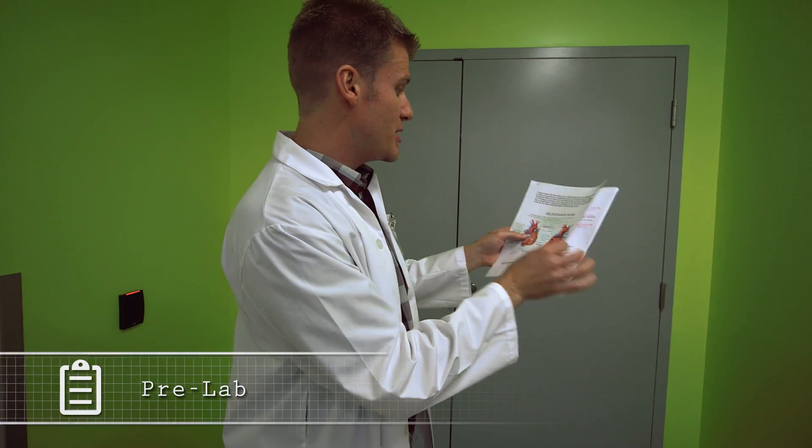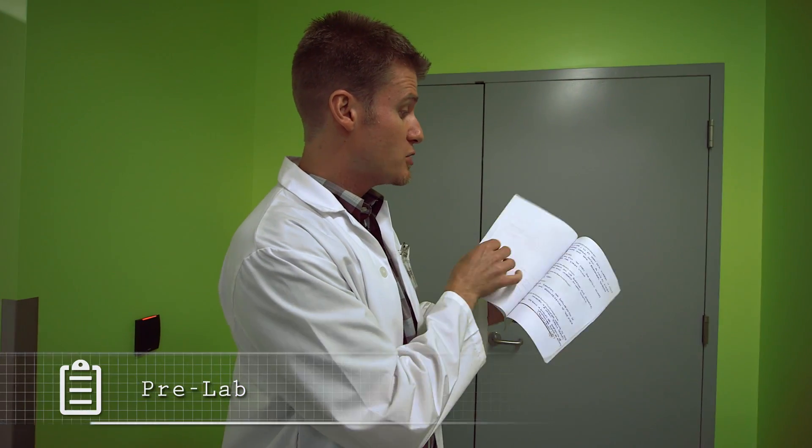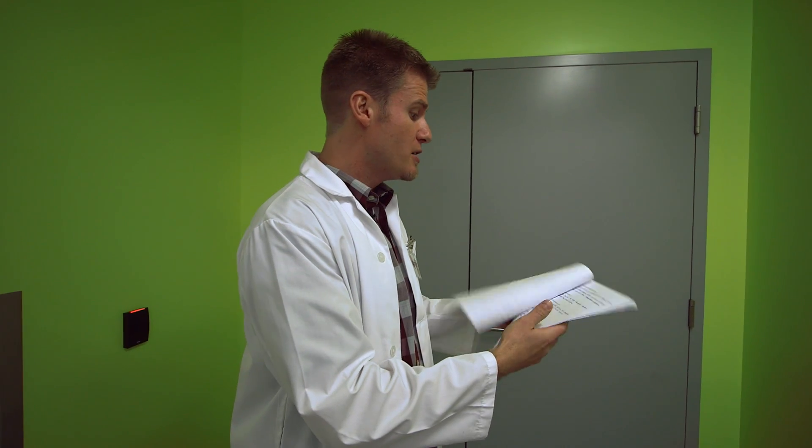Oh, there you are — you're just in time for lab, let's go! Before we go, I need to check your pre-lab. You won't be admitted into the lab unless it's complete, so make sure you use any resources and materials you need so that you understand all the experiments and all the work that's going to be completed.